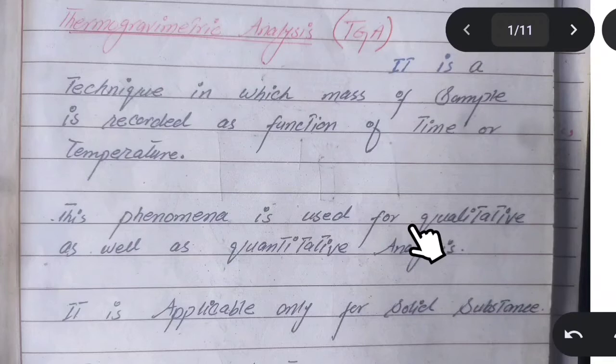Let's say, for example, I want to assess the composition of a blanket, which substances are present in the blanket. If we only have to identify the substances, it is called qualitative, while how much of the substance is present in the sample is identified by the term quantitative. So qualitative represents identification, and quantitative is related to the term quantity.